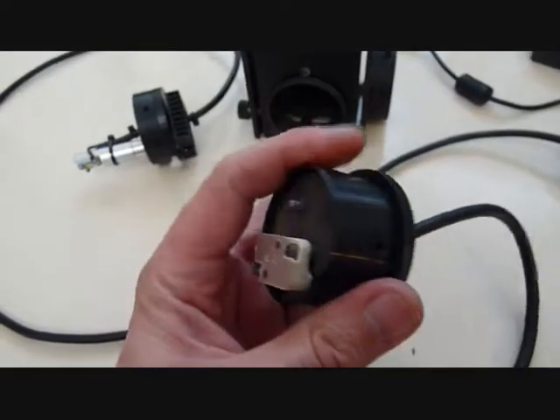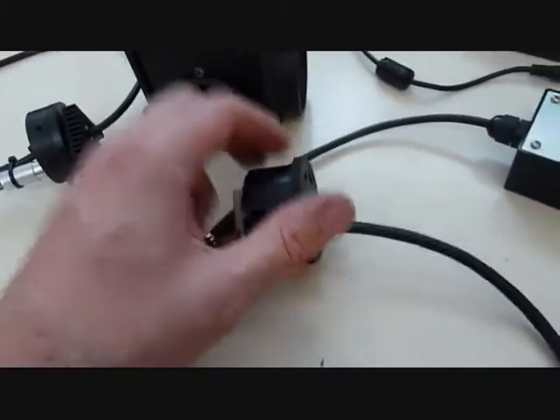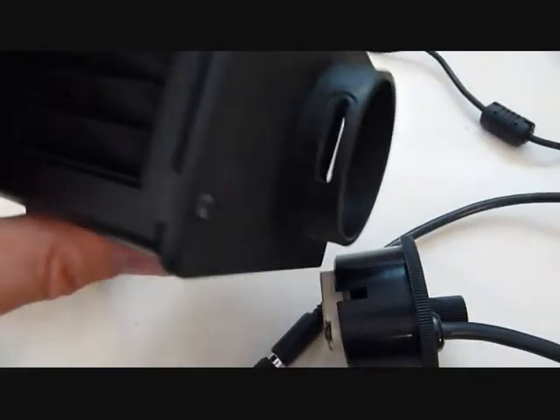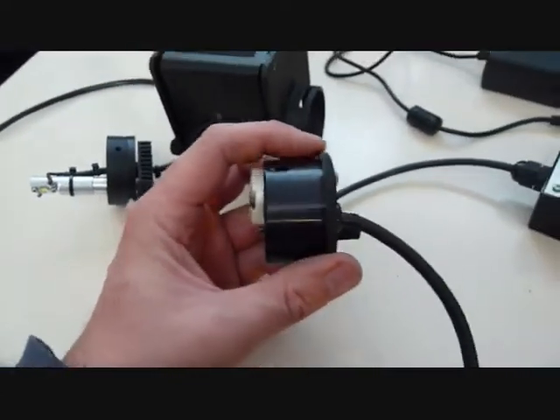It's got a screw here to move the bulb to the left and right. And then it's got a slotted hole to rotate the housing to move the bulb up and down.